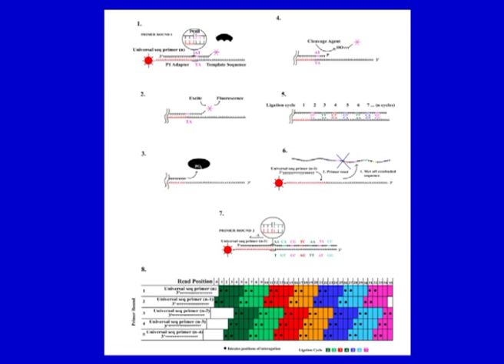This is summarized here. If you can see, this is the original primer, then there is the n minus 1 primer, the n minus 2 primer, and in each cycle there are certain overlaps, like these 2 bases were the first, and then the next 2 bases were these. Likewise, there is an overlap of these sequences, and finally you will get the full sequence as you go. Each time, ligation and priming reactions with primers shortened by one nucleotide, and different probes, are performed.